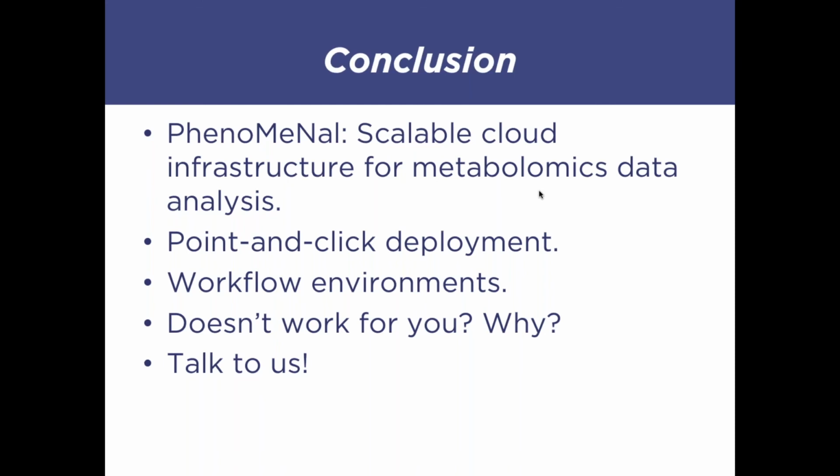Gamal Akabani is asking if Galaxy is different than PhenoMeNal. Galaxy is just a component that we use in PhenoMeNal. You can have other Galaxy installations provided by other people.